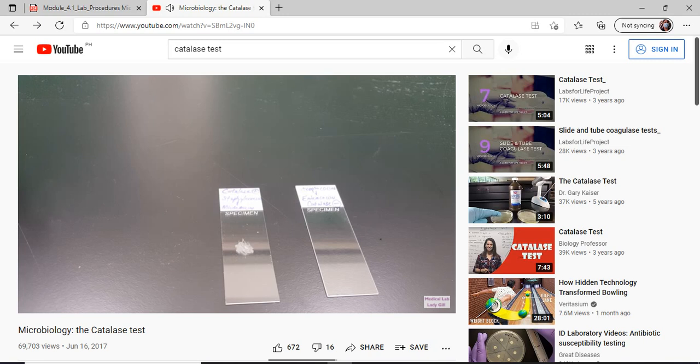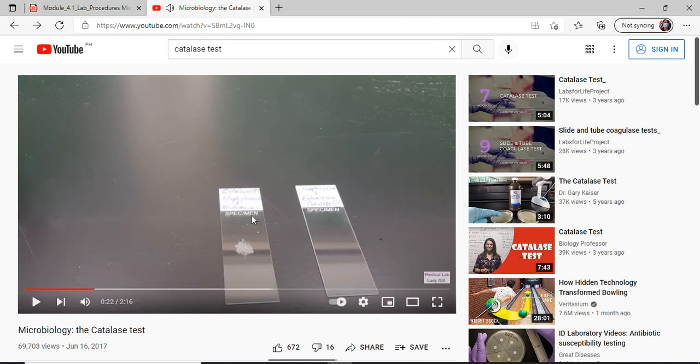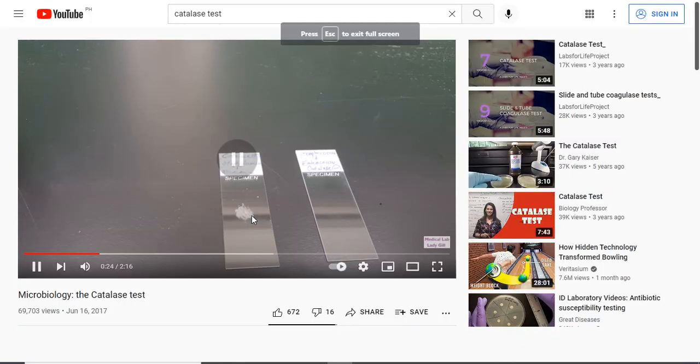So what I did was I labeled the organisms out of the first grouping of organisms we use in class, which are gram-positive cocci. So we have the Staphylococcus and the Micrococcus that should be positive, and the Enterococcus and the Streptococcus, which should be catalase negative. Now, if you look at the scheme of things, most everything is catalase positive except for strep and Enterococcus.